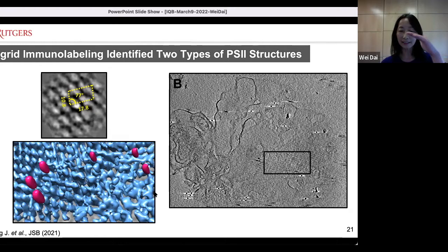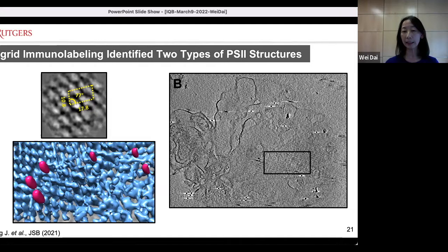The 2D averages provided some information showing these are PS2 structures, but the resolutions are relatively low and they are 2D. We decided to increase the scale of the project to collect many more tomograms to allow us to do 3D data processing.